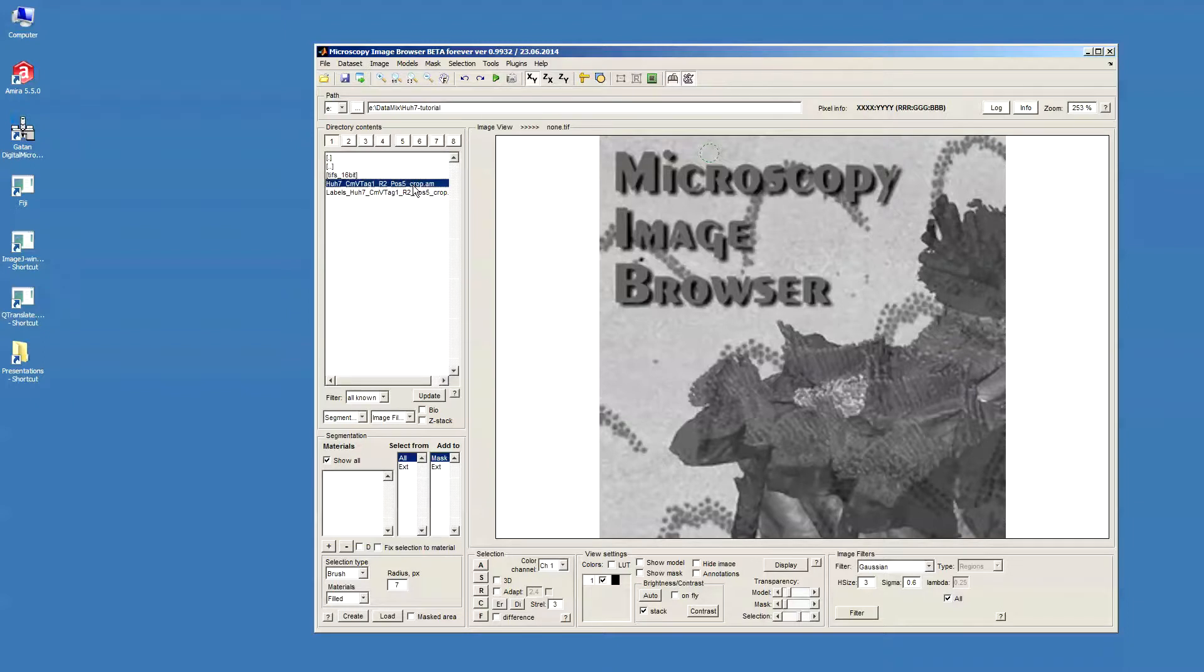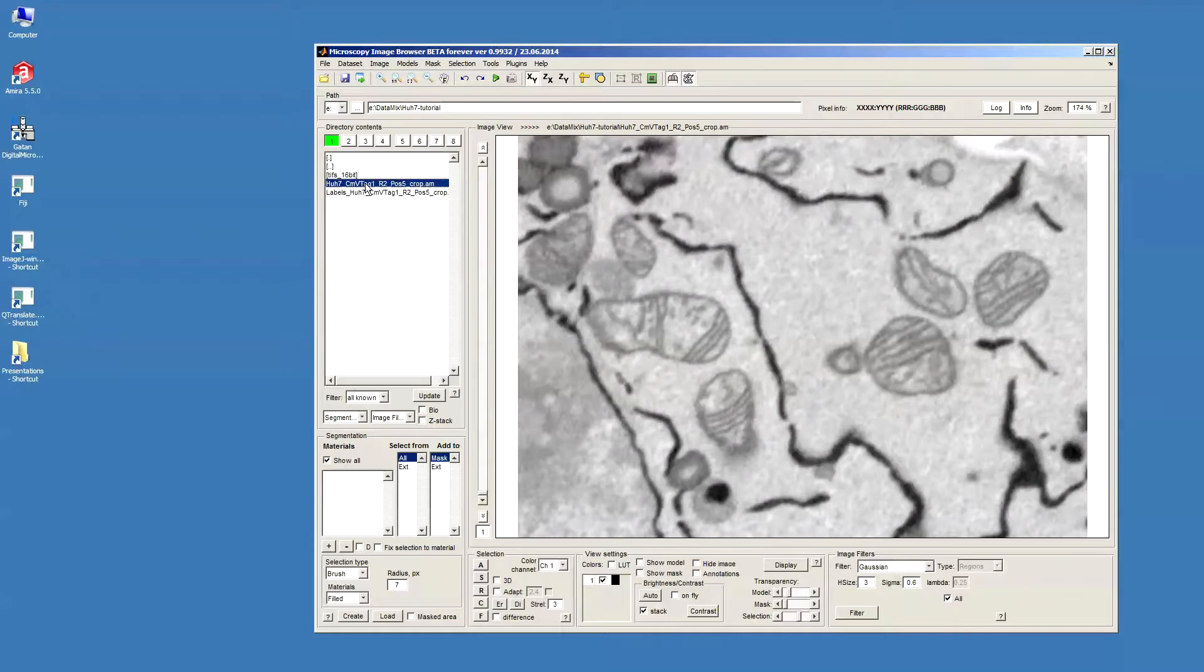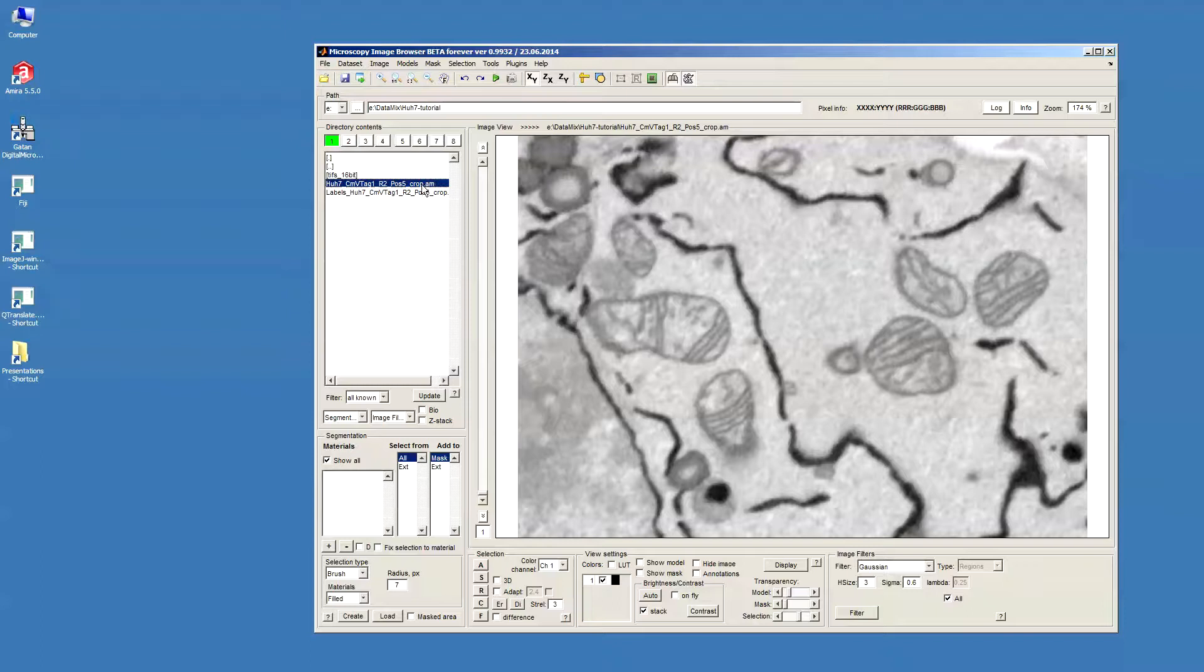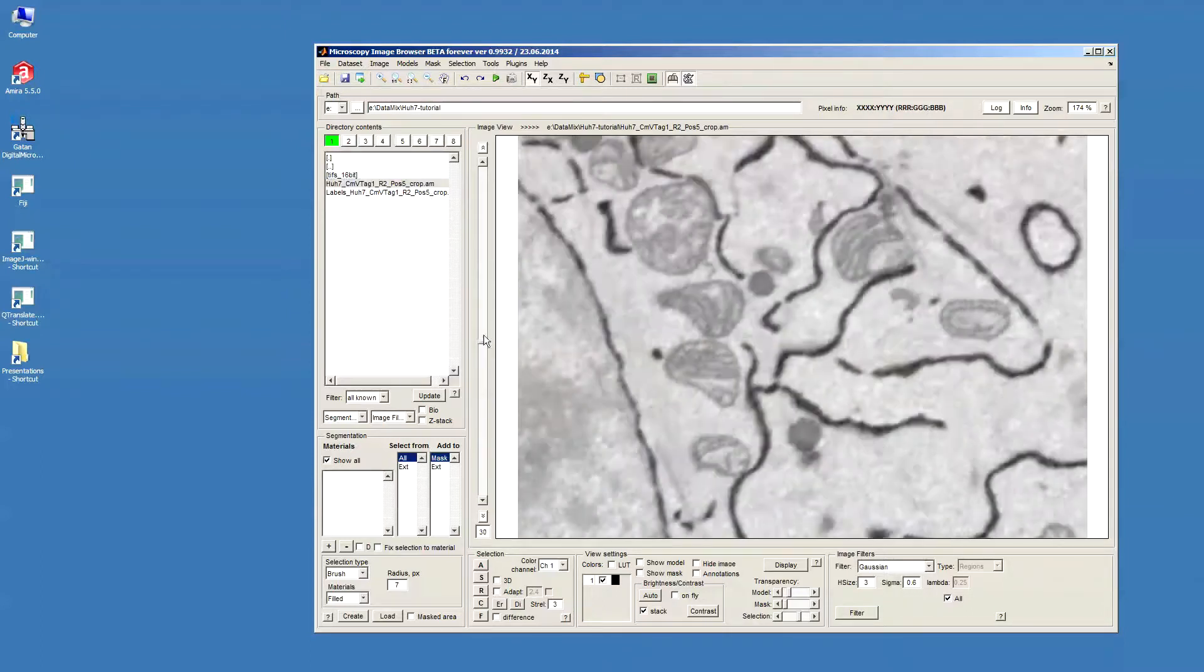Let's start with opening the dataset. I just select the dataset and double-click on it. It was saved in this AmiraMesh format, which has the whole stack stored in one file.